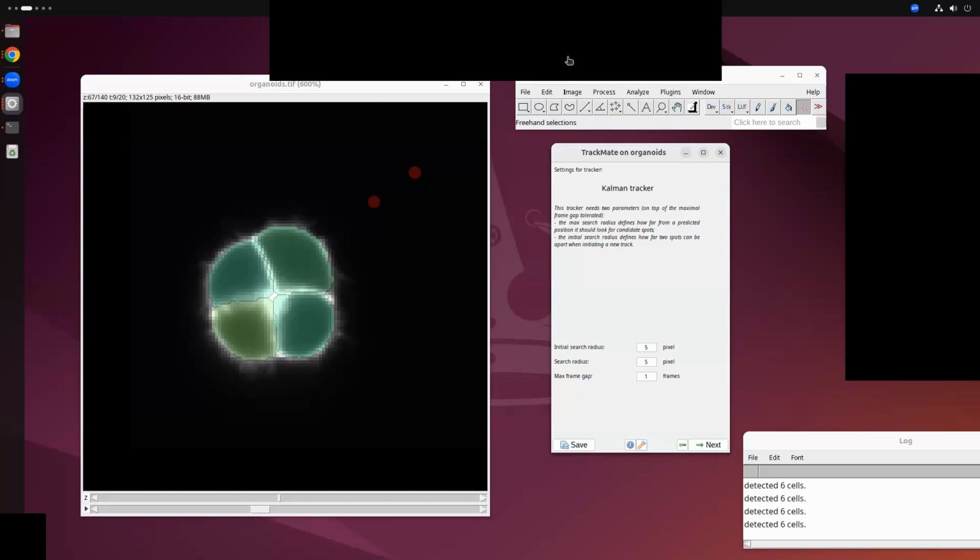So this is how we do it. As you can see, we have our own internal server for our internal users, on the intranet. This is how, for example, we support microscopy facilities: people at the microscopy instrument can start running processing while they are collecting data, because those instruments usually don't allow you to install very elaborate software packages, but they don't need to. They just need Fiji ImageJ there, and they can connect to our internal server. I hope that answers your question. Anything else?